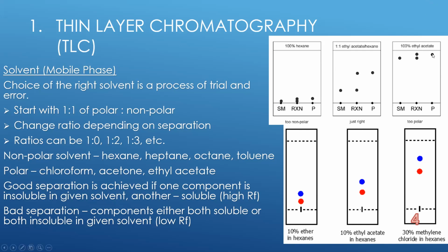But it is usually a ratio of the path that such a dot traveled to the finish line. The finish line is usually located at the top of every plate. You could see it at the top. So the path that the dot mark traveled from the start line. The start line is located at the bottom. We also will review this later, what this means.